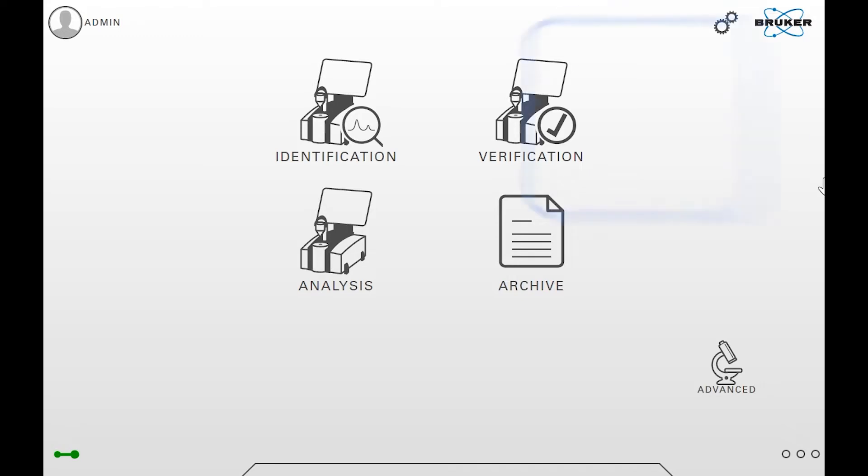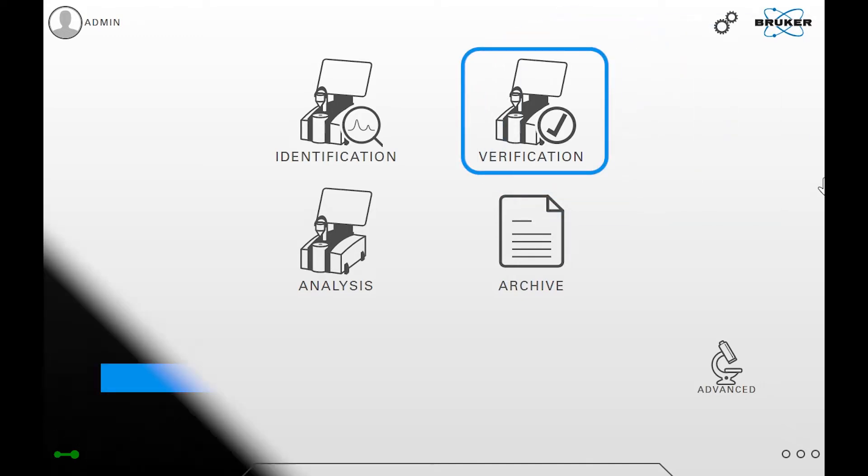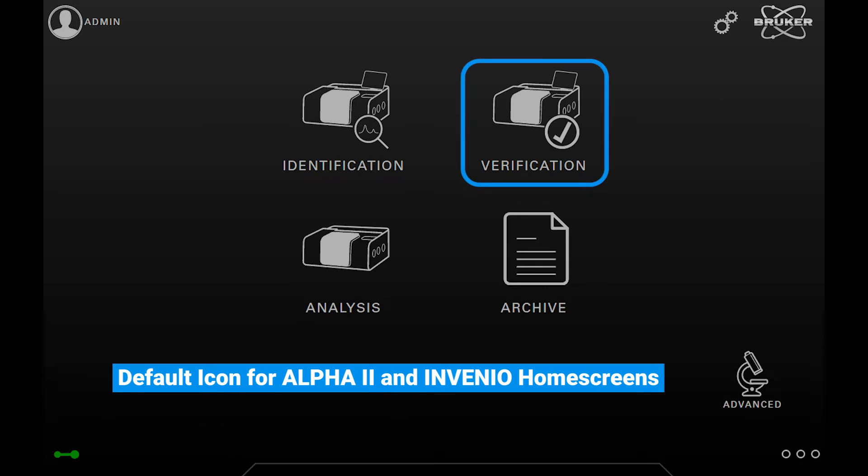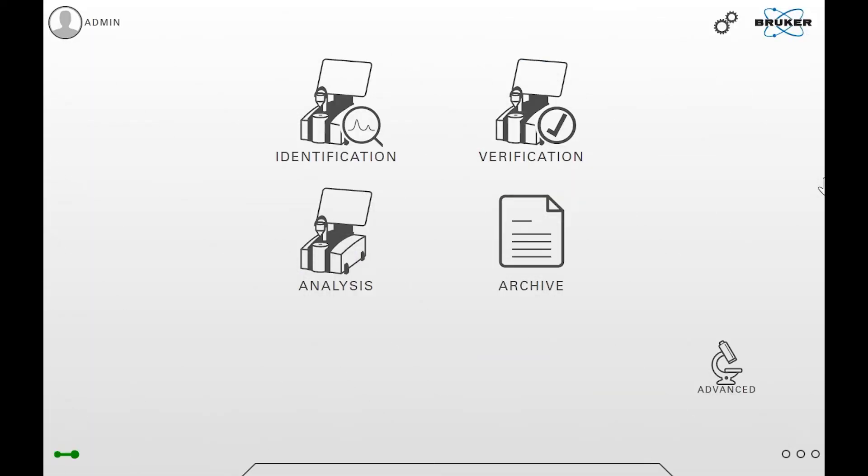Start by clicking the verification button on the home screen. This button is present on the Alpha and Invenio S home screens by default. On other home screens it can be added manually.